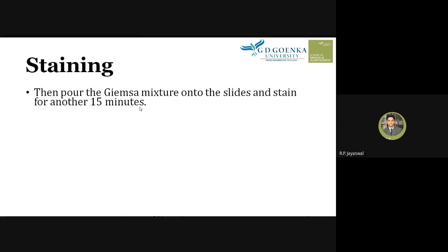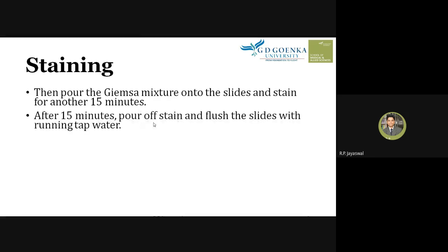First of all you have to stain with the May Grunwald stain for 10 minutes, and next you have to stain with the Giemsa mixer or diluted Giemsa stain for another 15 minutes. After 15 minutes, pour off the stain, means remove the stain, and you need to flush the slides with running tap water.